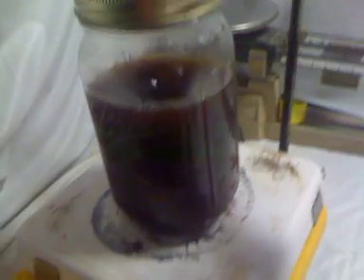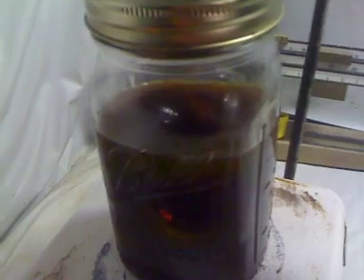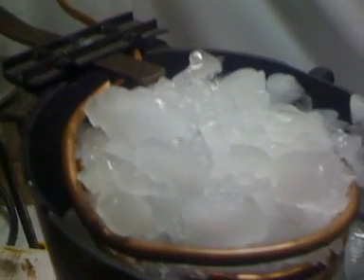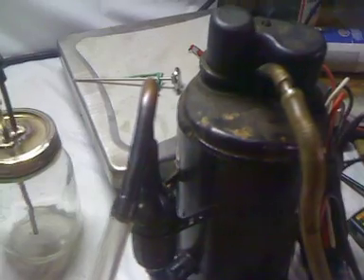Here we have 500 milliliters of glycerin on a hot plate stirrer, and the temperature of the glycerin is right at 136 to 140 degrees. We have our condensing coil filled full of ice running over into our catch container, with the tube going down to the bottom, and we have just a refrigeration pump vacuum pump already connected.